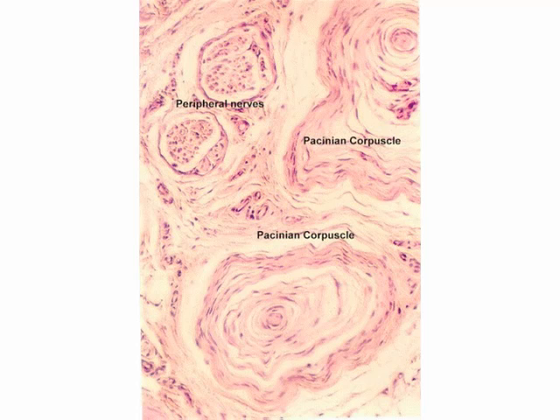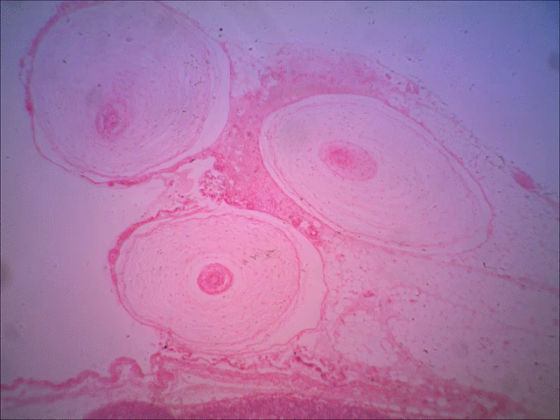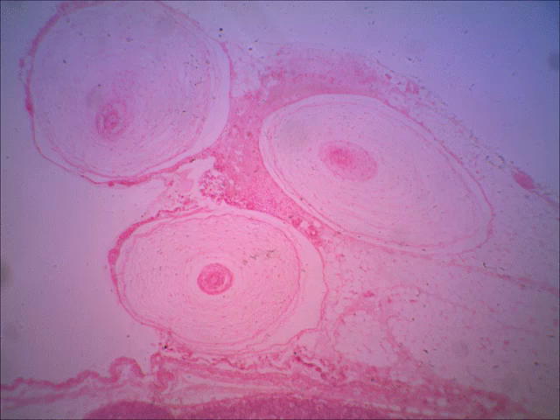Let's look at some other slides of pacinian corpuscles. Here you can see two, and the way to recognize these — it just looks like circles with other circles with other circles around them. A lot of times we describe these like a sliced onion. They're really easy to recognize. On this last slide in this section, here you can see three pacinian corpuscles, and they really do look like sliced onions. I believe this one is located just outside the wall of the pancreas.